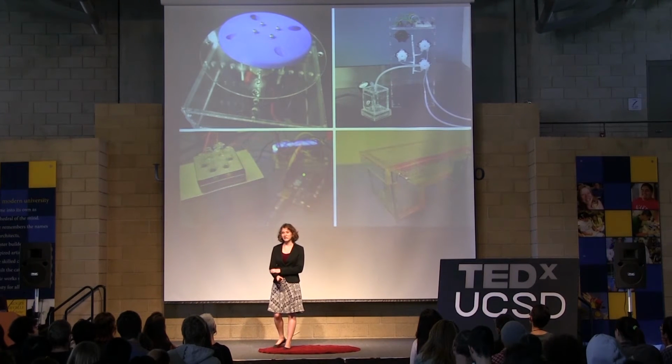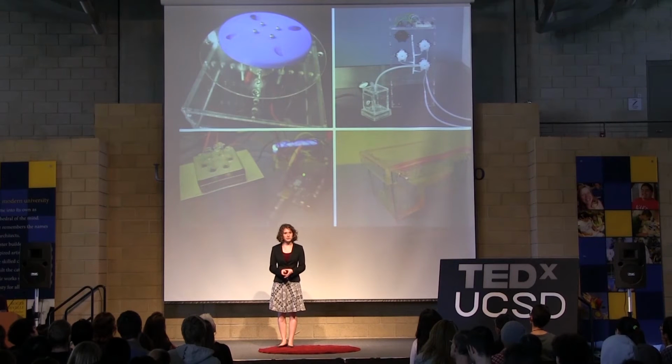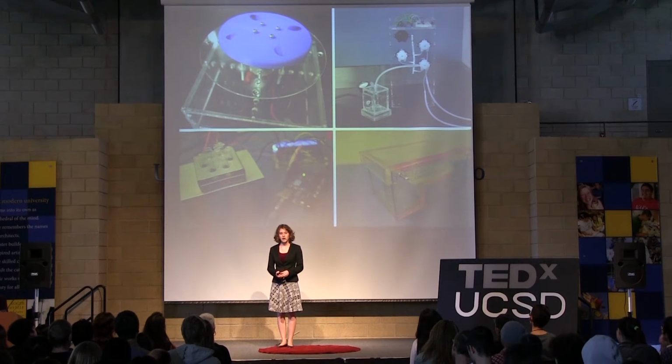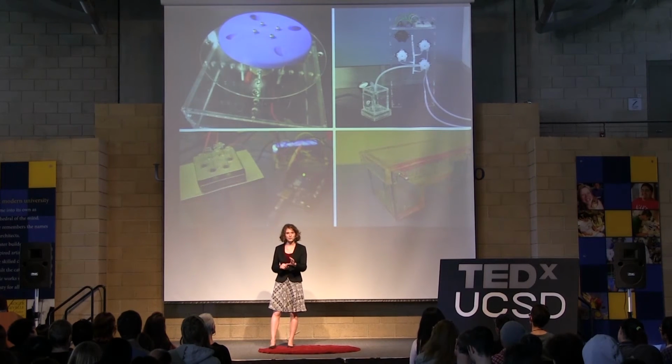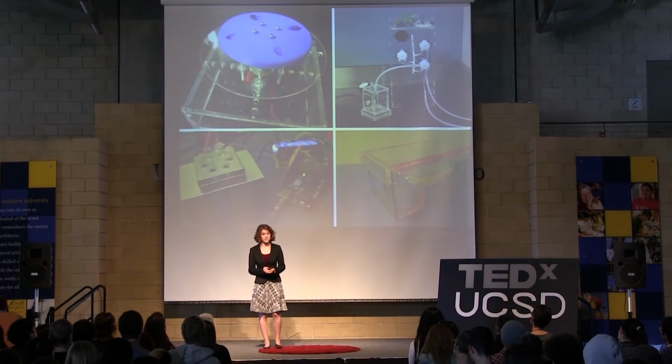So when you take a blood sample from a patient, the first step is to isolate the blood plasma, as I mentioned before. So what we use is a centrifuge, and using the high-speed rotations, this creates a force that separates the cells from the liquid component of blood. And now, as I mentioned before, if a treatment has failed, then there will be virus in this blood plasma. So the next step is to extract the RNA.